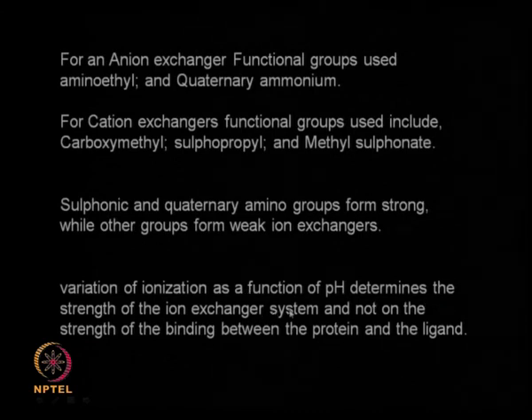Okay, so the variation of ionization as a function of pH tells you the strength of the ion exchanger. It doesn't tell on the strength of the binding between the protein and the ligand. Okay, it doesn't tell how strongly the ligand is bound to the protein. It just tells you the strength of the ion exchanger, that's all.